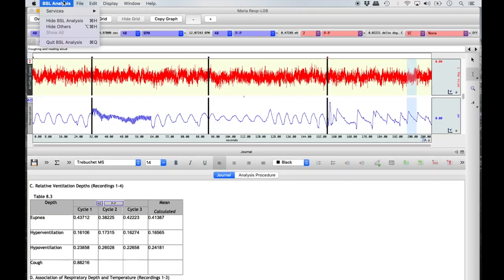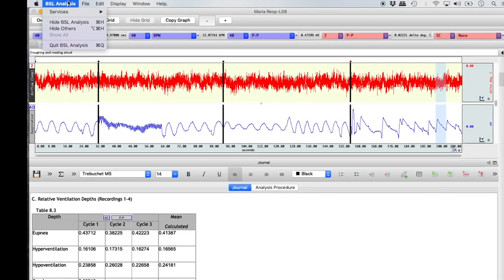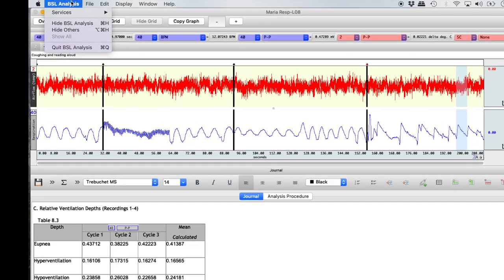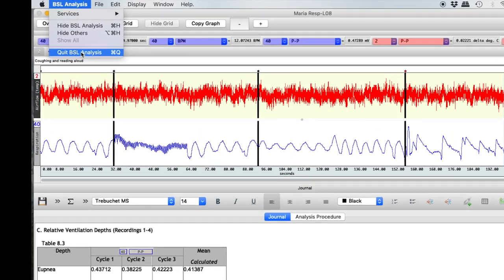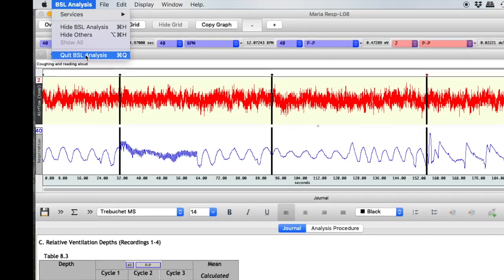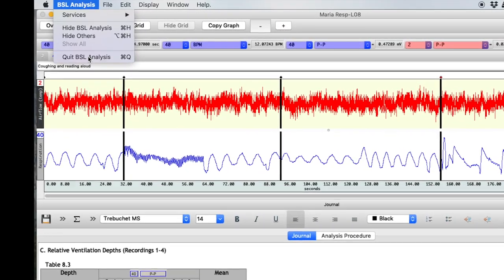You are now ready to exit out of the application. Select BSL Analysis from the top menu and then select Quit BSL Analysis.